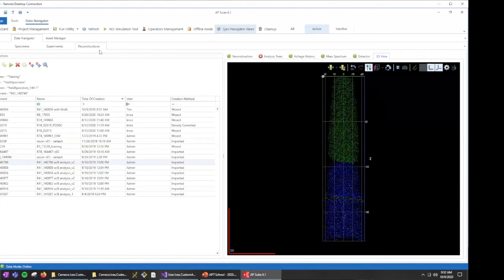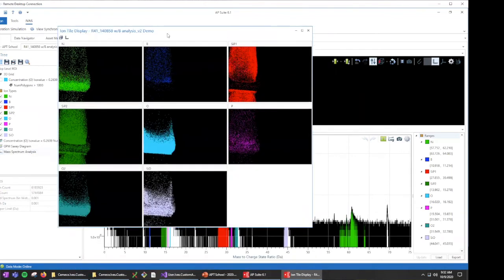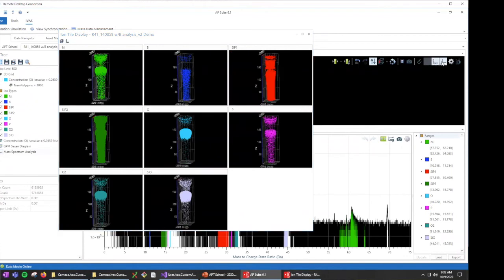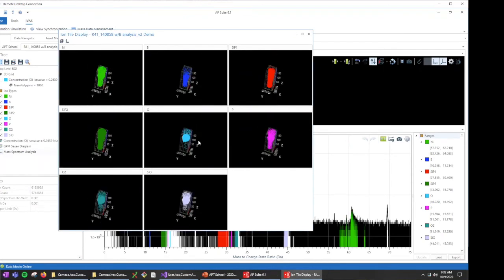So maybe one question that I can throw in, because we had some metadata and large-scale data analysis thoughts going on in the last session. Is there any direct way to interact with the metadata database? We used to have what was the database called in the old days? ISDB. The program was called ISDB. Do we have some way to interact with whatever replaced ISDB, probably either a MySQL or a NoSQL kind of database? Is there any way that we can go in and just pull stuff out of the database?